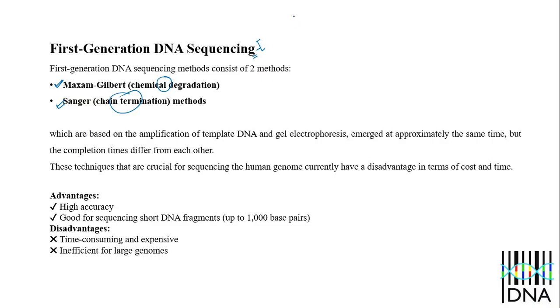In this sequencing, first we prepare the library, then do the sequencing, then gel electrophoresis, to find out the exact order of the sequence, the order of your molecule.